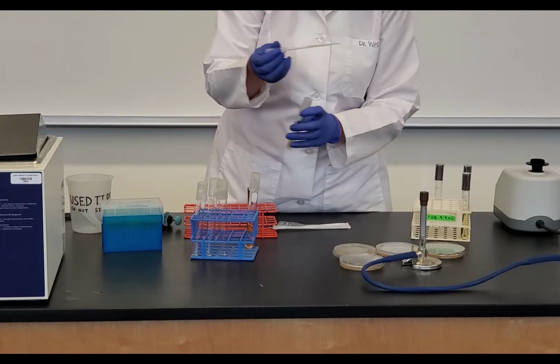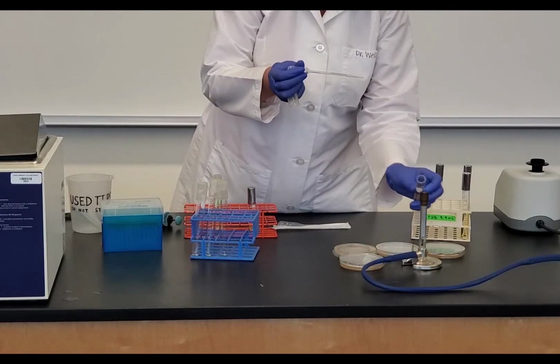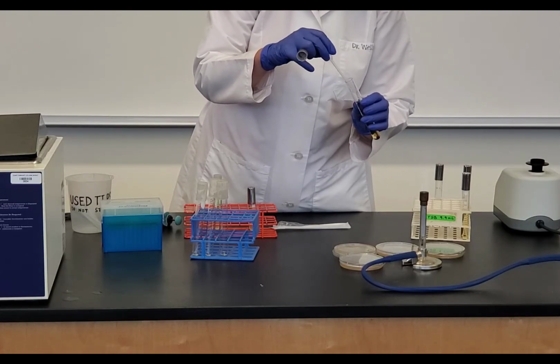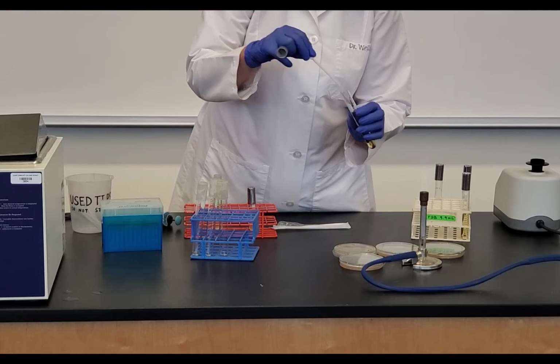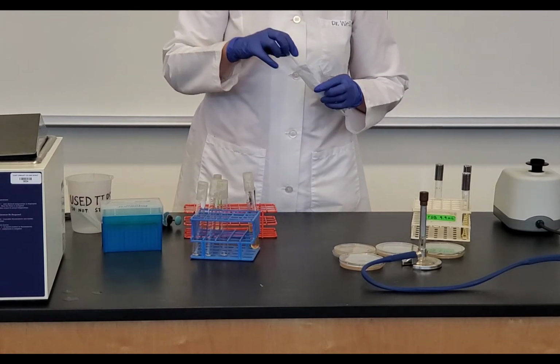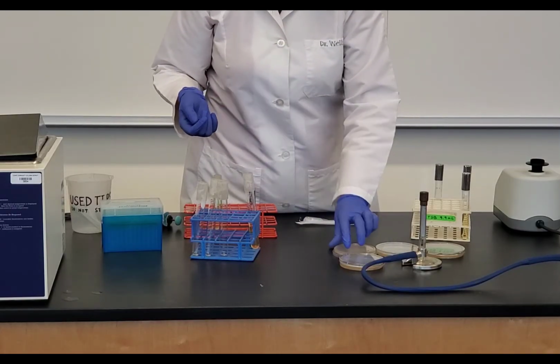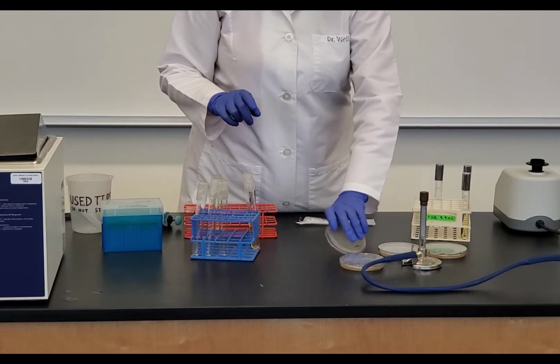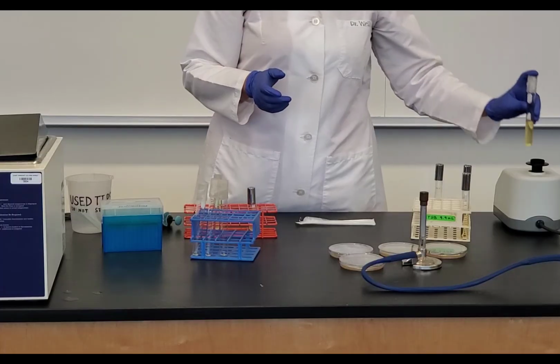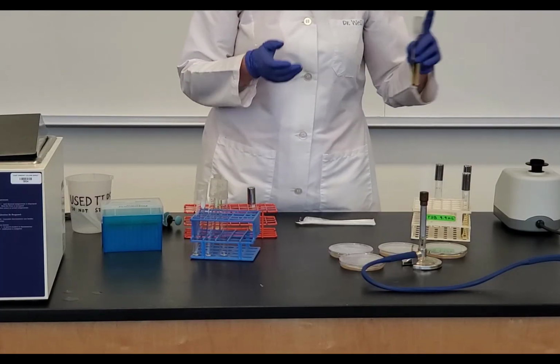Flame it, cap, add it to my agar deep. This time it doesn't matter if I touch it because I'm on my last one. And I should have flamed it before I put the lid on it, but I'm going to flame it again here right before I pour it, so I didn't. I'm going to turn my 10 to the negative 6 plate over. I'm going to vortex this to mix it.